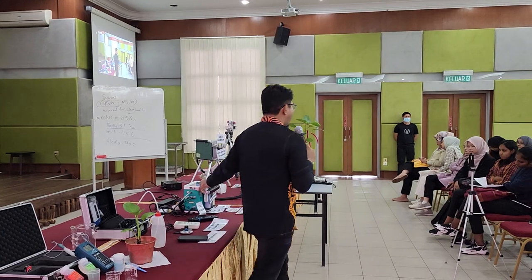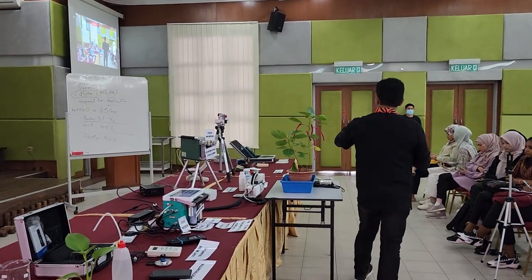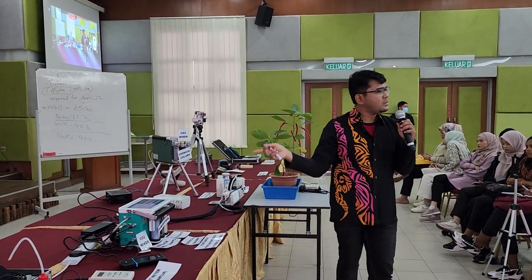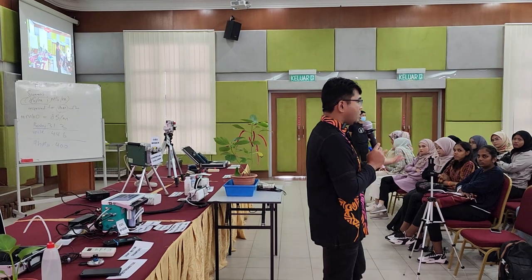Okay? And then we use this SPAD machine to quantify, oh, the photosynthesis is high now. Is it due to pigments? So this machine will validate your hypothesis.